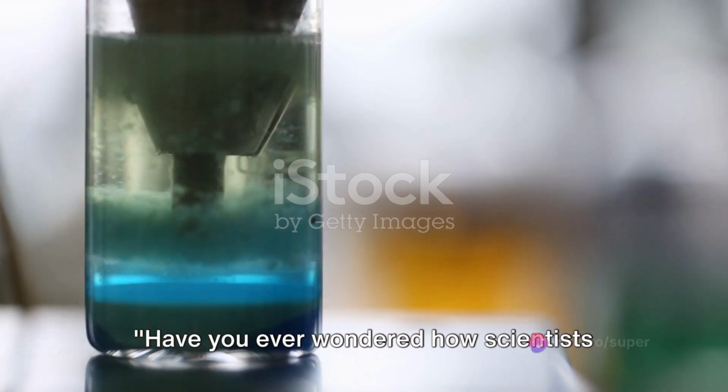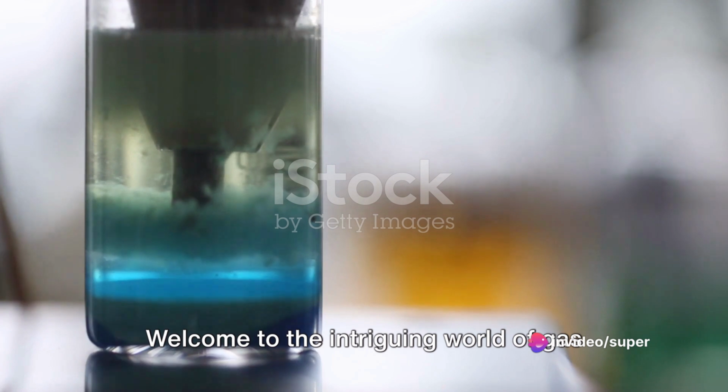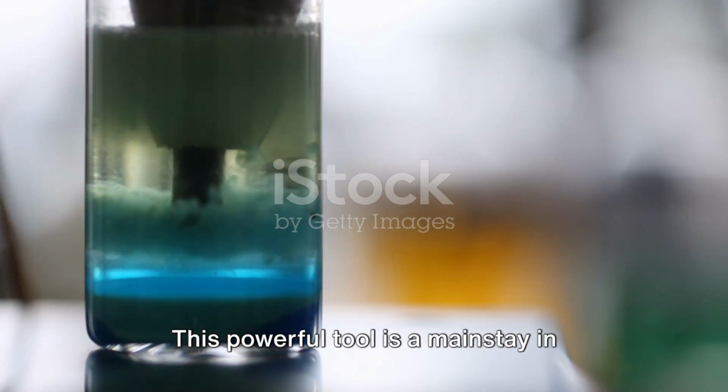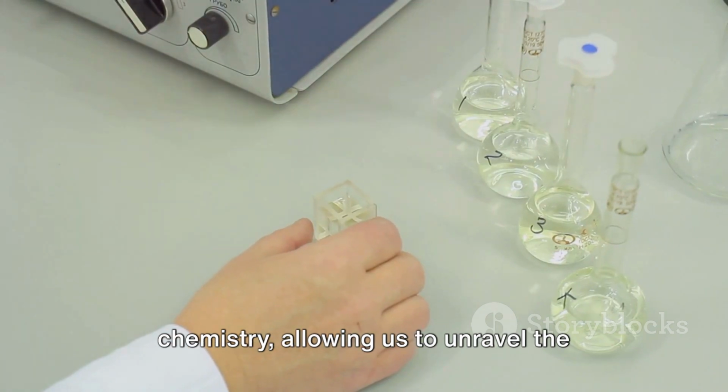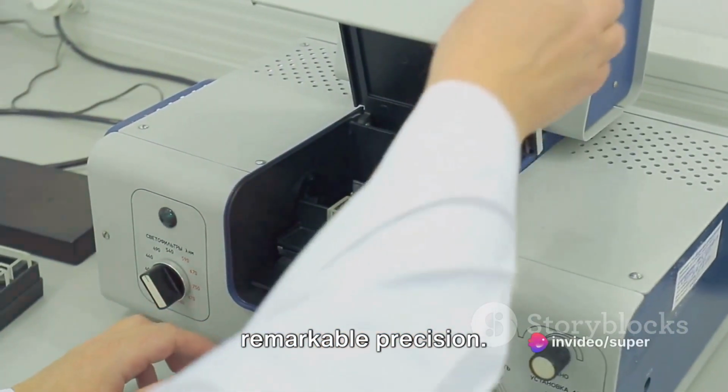Have you ever wondered how scientists separate and identify complex mixtures? Welcome to the intriguing world of gas chromatography, often referred to as GC. This powerful tool is a mainstay in chemistry, allowing us to unravel the mysteries of complex mixtures with remarkable precision.